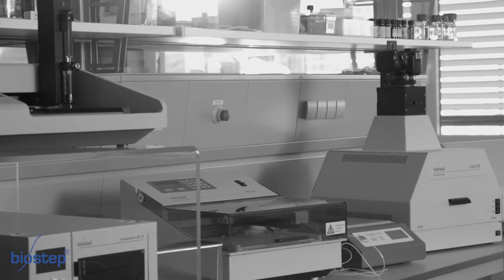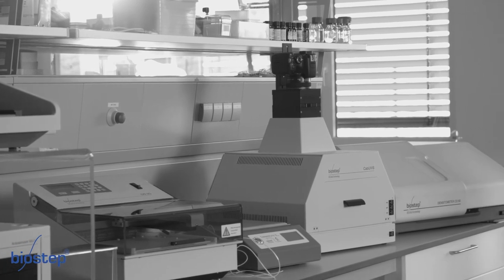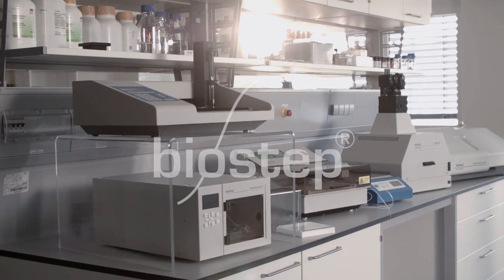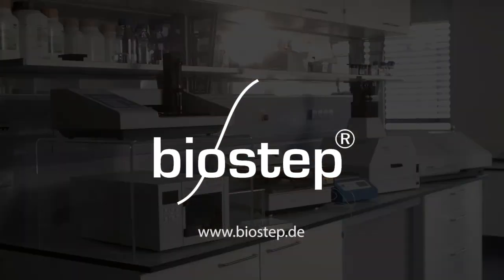Are you interested in even more TLC products? We offer a wide range, starting from sample application up to quantitative analysis. Please also watch our other videos. Be your step one step ahead.